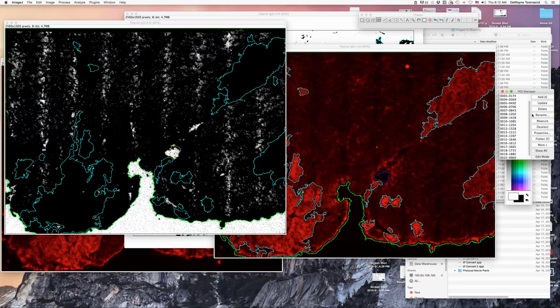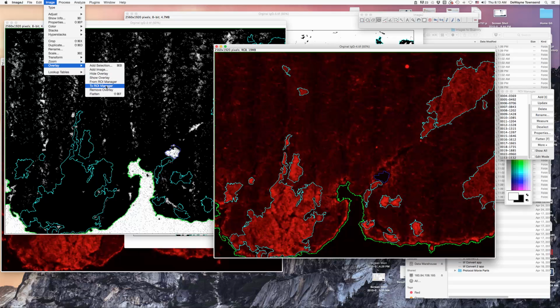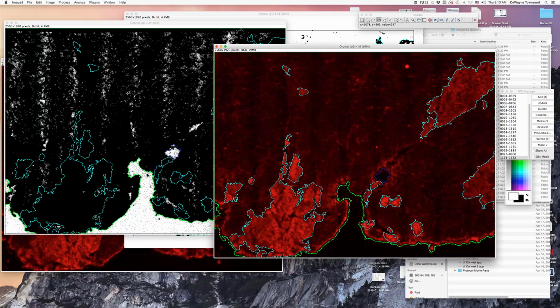It's all about the ensemble, how it turns out at the end. Properties blue, okay, let's see if that's any better. Okay, you know what, I'm going to call that good enough, because we could spend all day trying to maximize that. All right, so now it's time to sort of document the work and to save it.